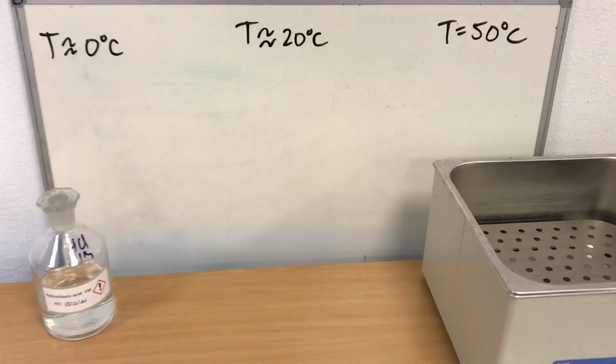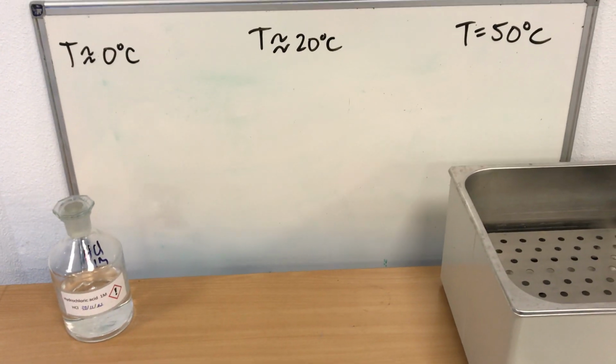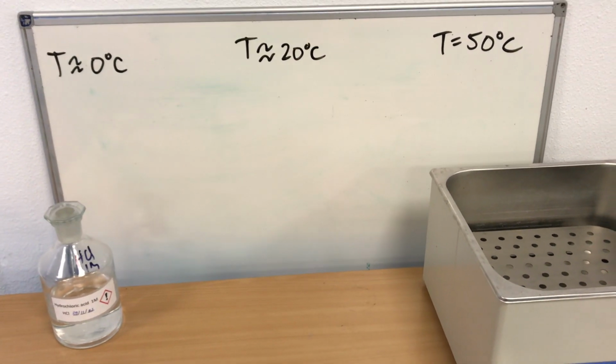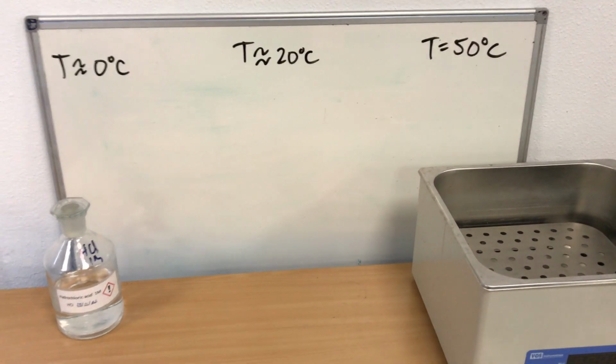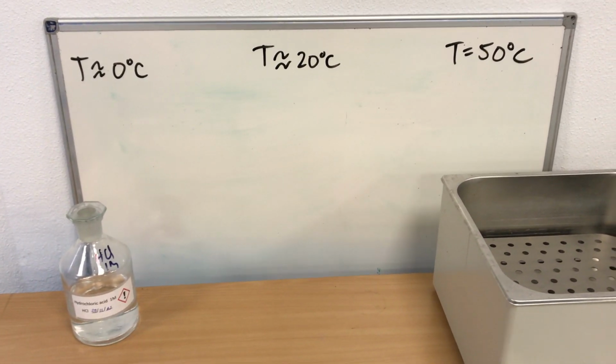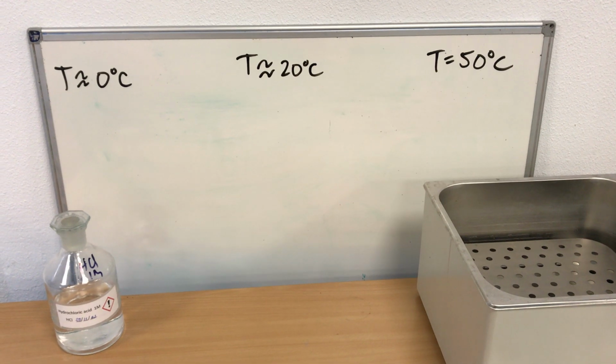But you will need to decide what 5 temperatures you are actually going to investigate. And 5 is a minimum. If you wanted to do more than that, you are encouraged to go beyond the minimum expectation. But you will have to outline a method for what 5 temperatures you will use.